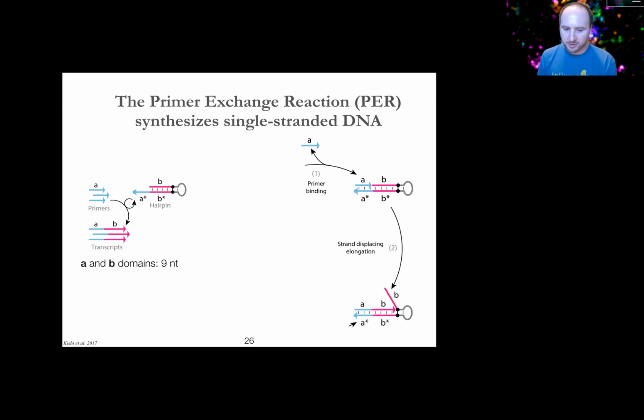If those conditions are achieved, then what you're actually left with is an equilibrium state, because the flap that's extended back has the same thermodynamic strength binding to the B star sequence as the newly synthesized B sequence does. So those two molecules are in equilibrium fighting for the ability to bind B star, the new B and the old B, but through the process of branch migration, they're just pushing each other back and forth. The key thing that happens is when you get to the state that's in the center bottom of the slide, where the new B is pushed back.